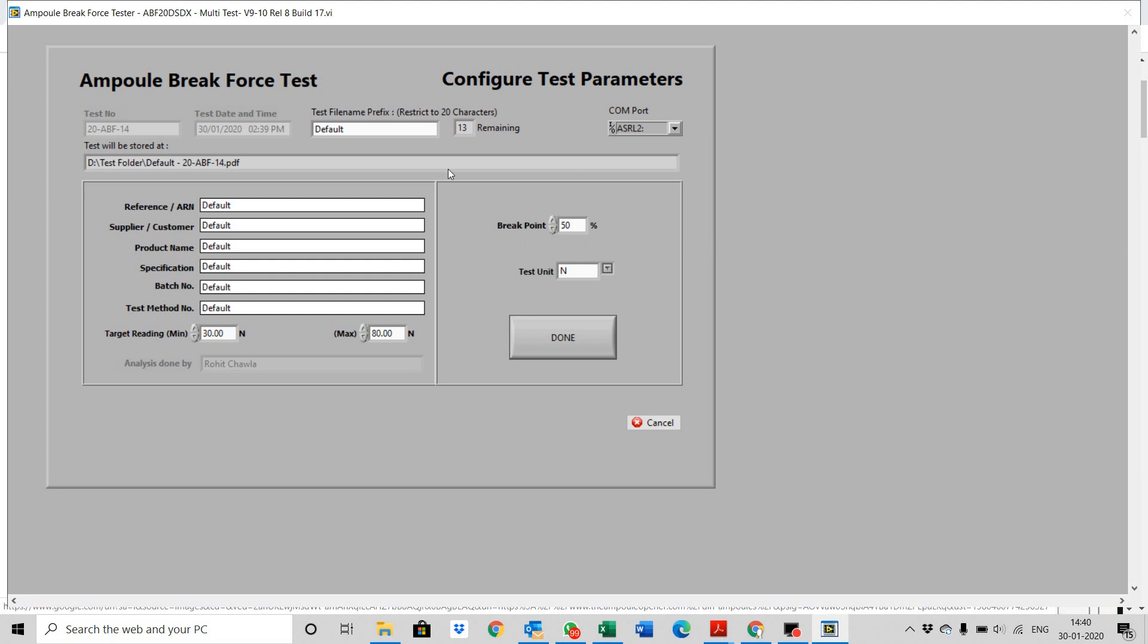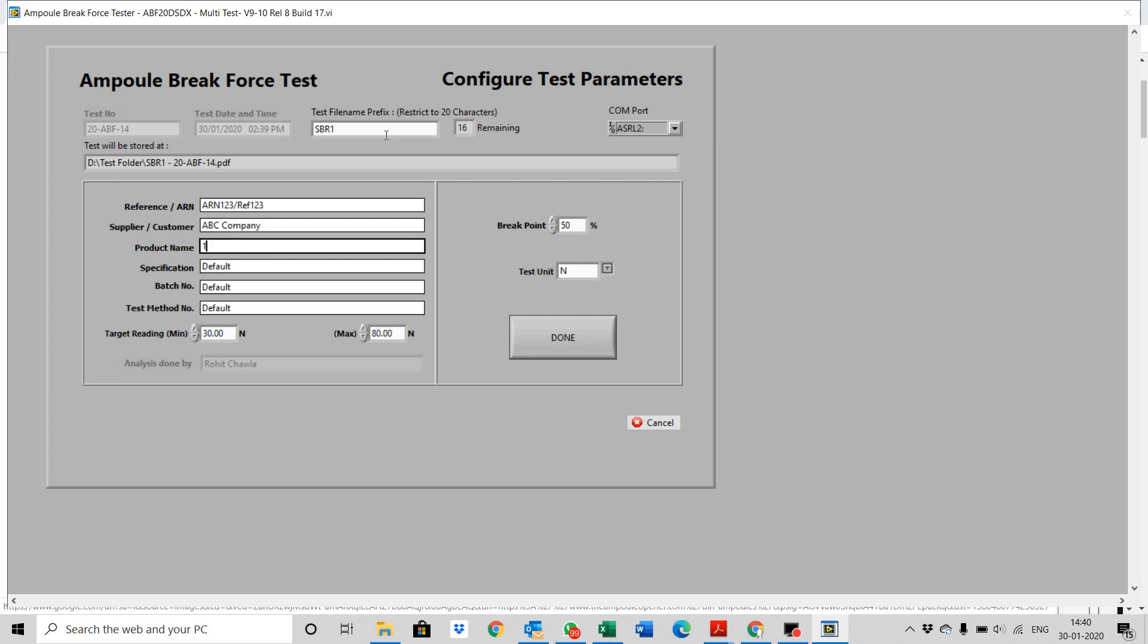If this is your first test, fill up the relevant details as shown. If this is a repeat test, the details from the last test will automatically show on the screen. Change only the fields that need to be changed.